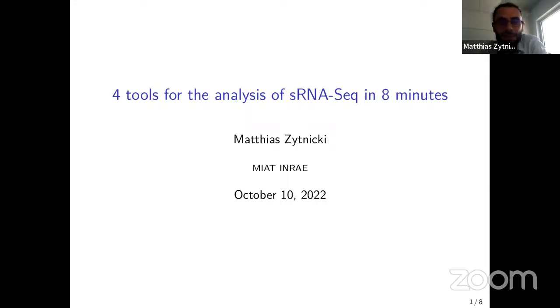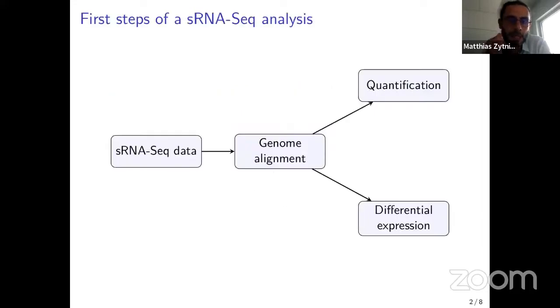So it's my great pleasure to present you my work on small RNA sequencing. So this is just bioinformatics, but I promise you that I won't have any equations or algorithms. I just wanted to present you some of the tools that I have been developing for the last few years now. So I will start with a very simple pipeline that you may use when you sequence your small RNA.